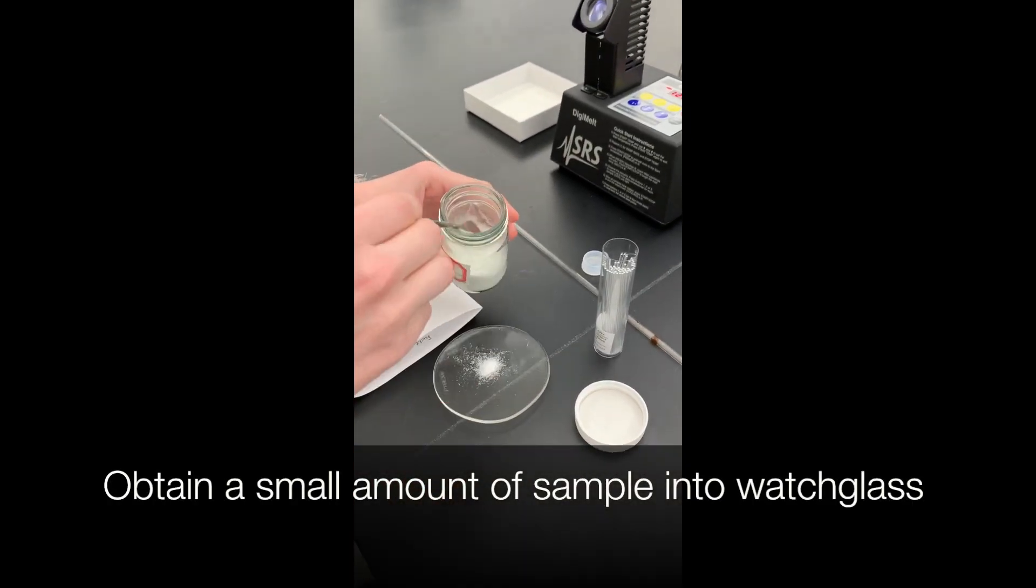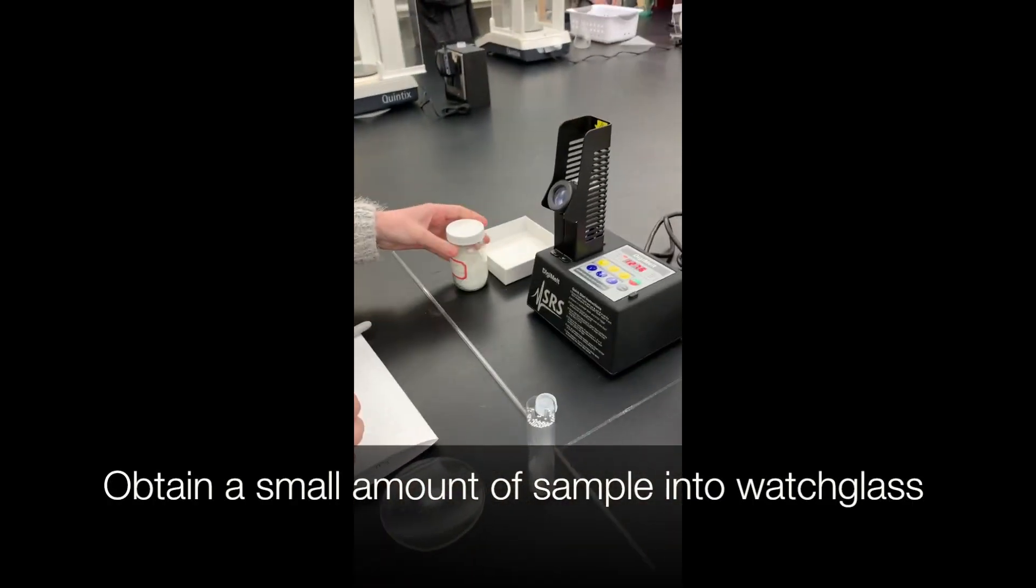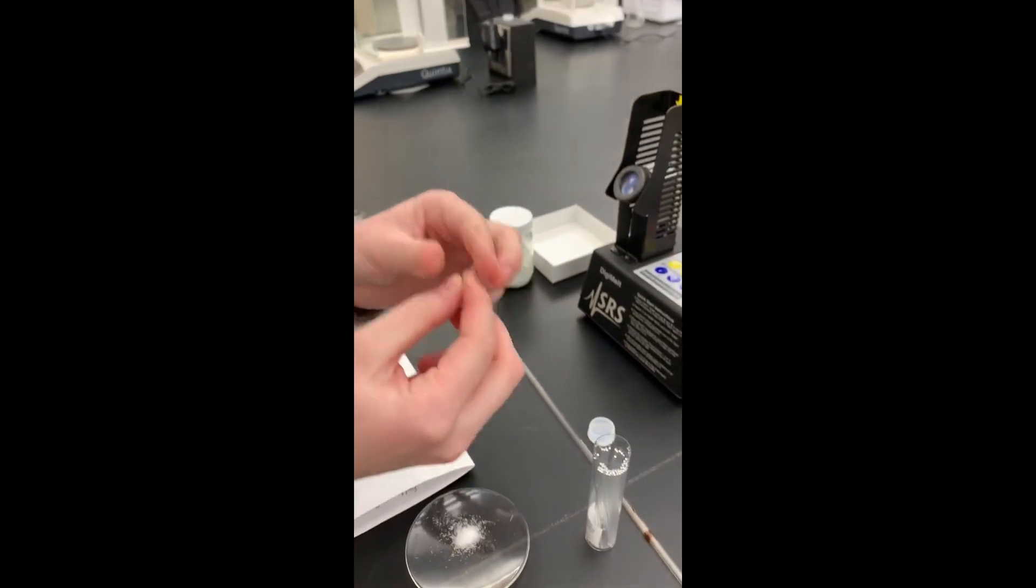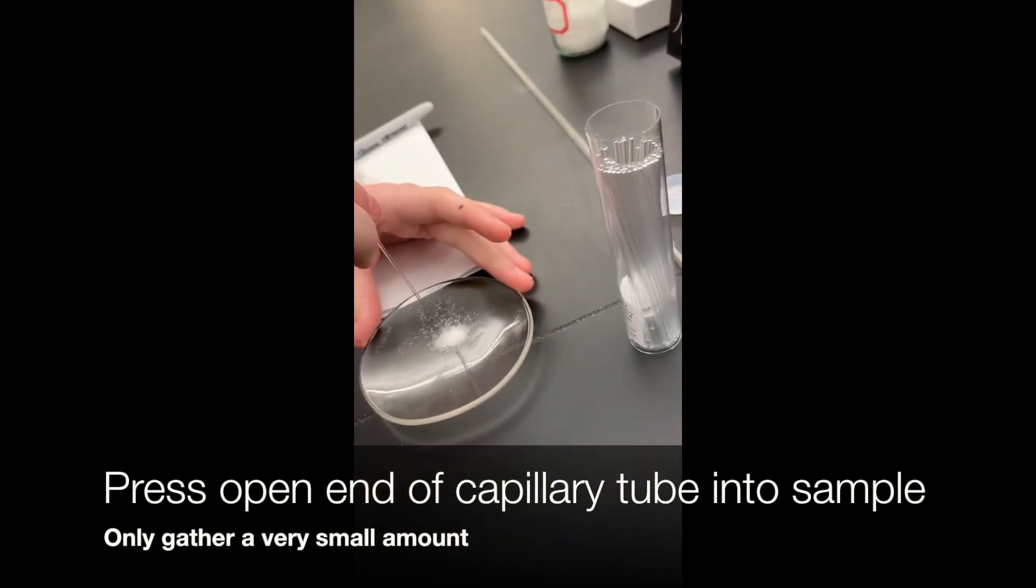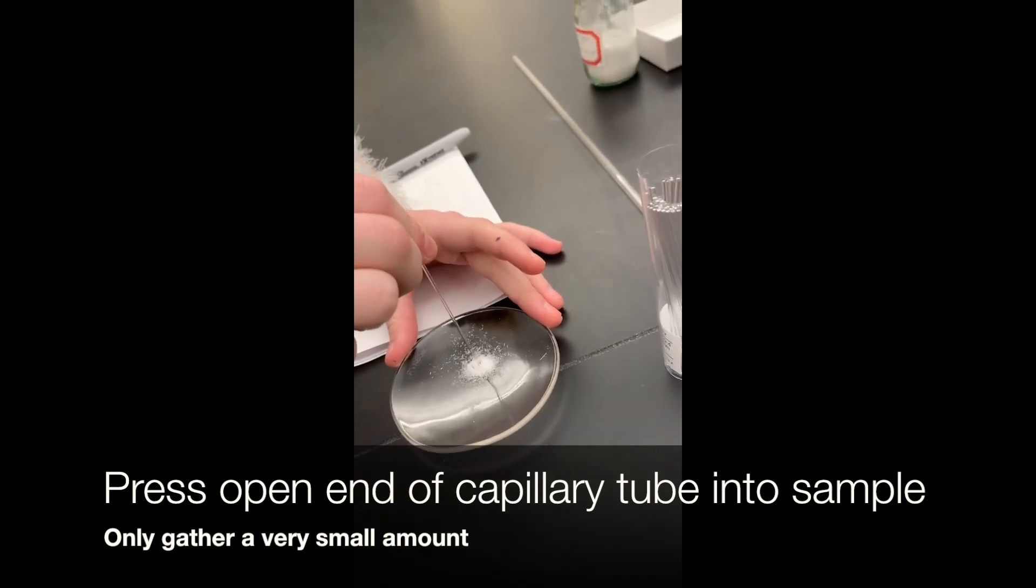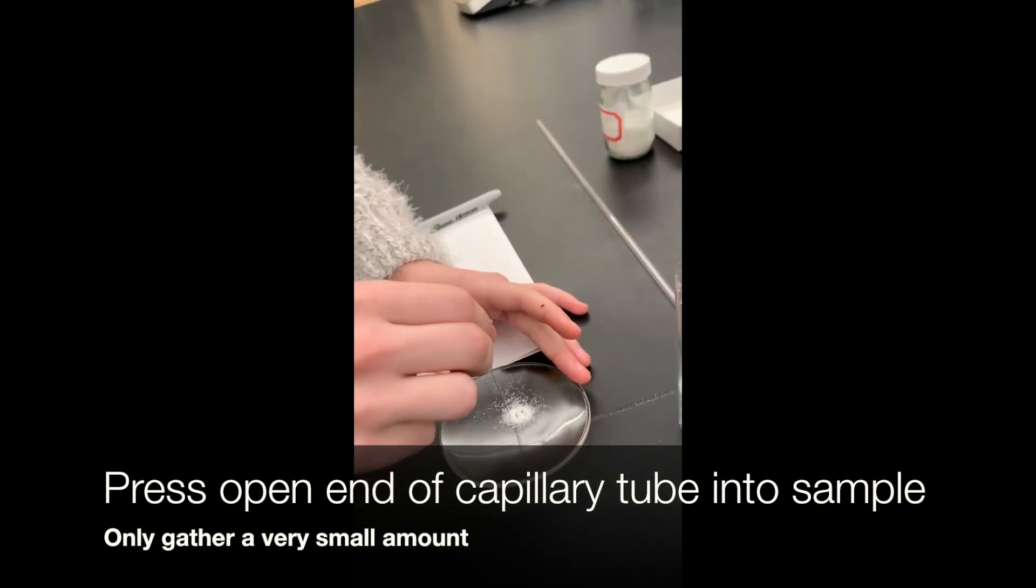Now you can prepare your sample. Place your sample on the watch glass and obtain a capillary tube, which is a small glass tube with one closed end and one open end. Push the open end of the capillary tube into the pile of sample one time so as not to gather too much sample.